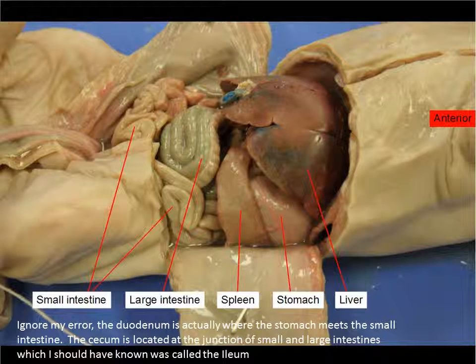The pancreas. There's a medical saying, and you're going to catch me on record here cursing. There's a medical saying that says, you don't fuck with the pancreas. Why? Let's phrase the question this way. Pancreatic cancer is one of the most lethal. Why?